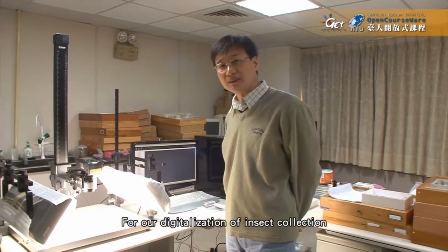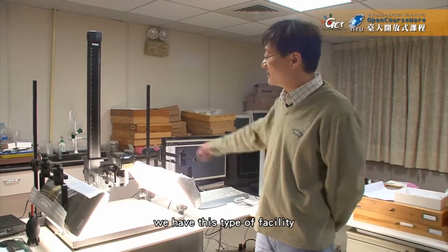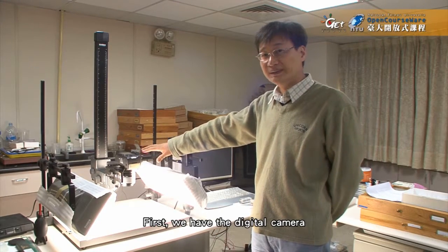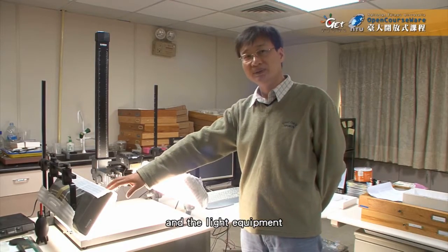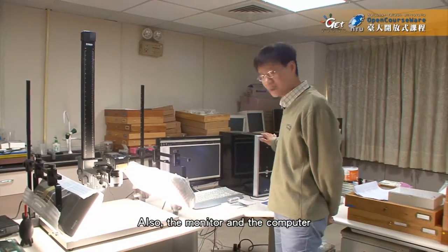For our digitization of the insect collection, we have to have this kind of facility. First, we have a digital camera and the light equipment, also the monitor and the computer.